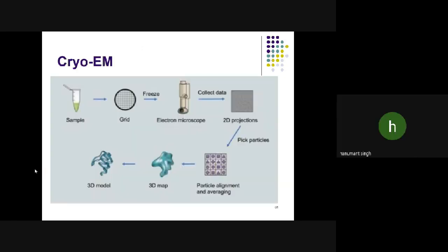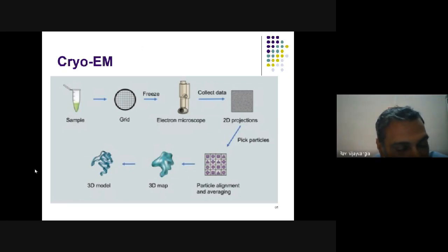Sir, what is the sample cost for this cryo-EM? You see, in India there is only one machine, most likely at NCBS Bangalore. I have never checked their website whether it is open to the public or only for the institute's samples. I am not aware. You can definitely Google it, but when I did it, it was a collaborative project, so we did not have to pay anything.